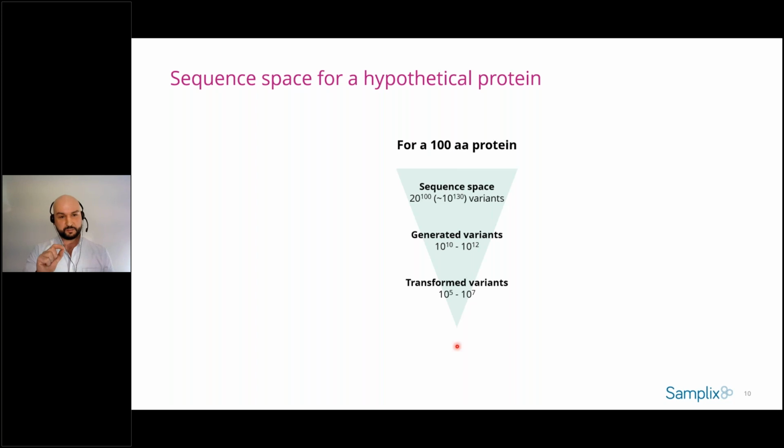So let's imagine on each position we exchange all the different amino acids, the 20 amino acid building blocks. This leads to an unbelievable diversity, right? A large diversity sequence space. And actually, these are more combinatorial possibilities than atoms available in the universe.